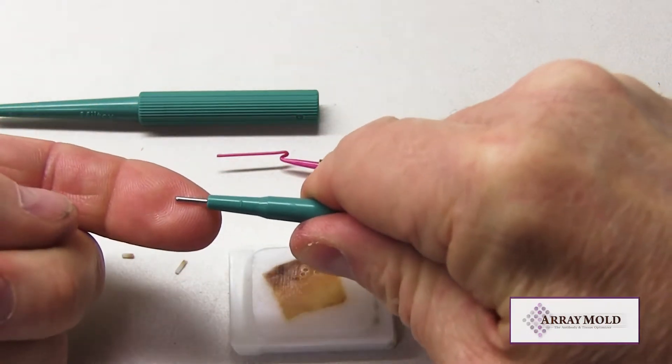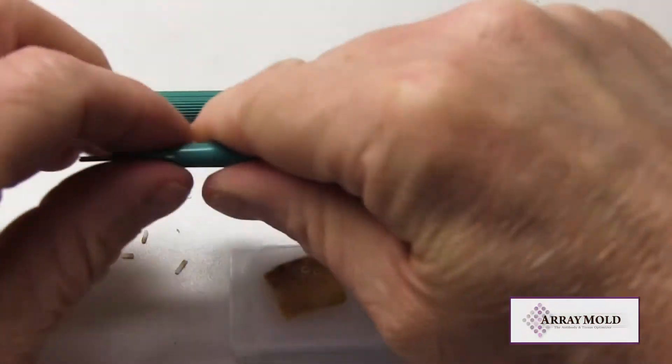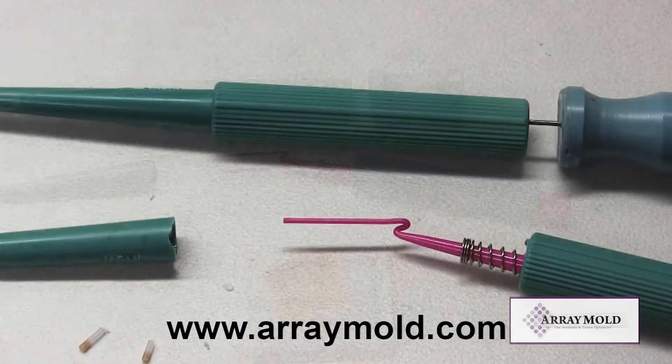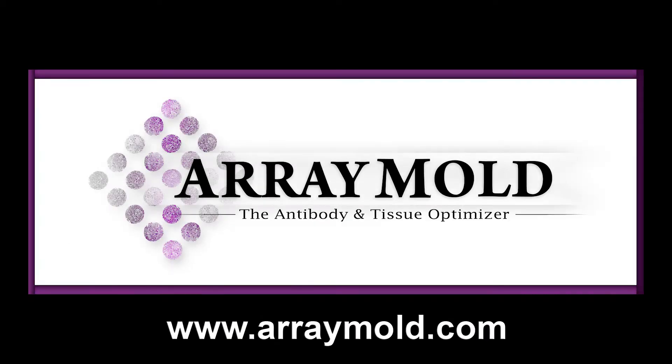These needles are also slightly different in size, so they are not interchangeable. You can only use that specific needle with the TMA instrument it was designed for. Please visit our website at www.arraymold.com to watch more instructional videos on tissue microarray construction.